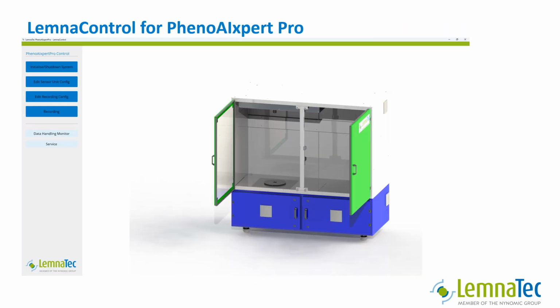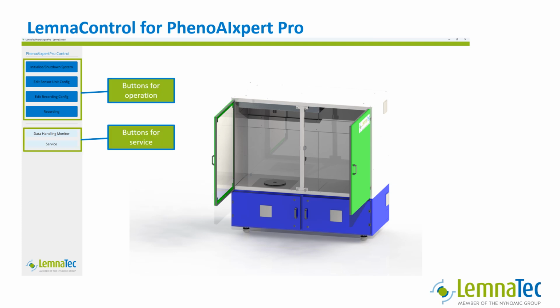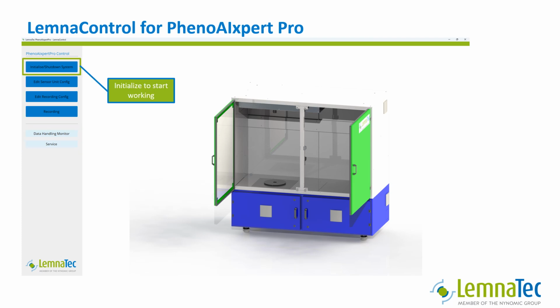Let's start with LemnaControl for the PhenoAIxpert Pro. This is the start page. The start page has buttons for operating the PhenoAIxpert Pro and buttons for service. To start working, we first need to initialize the system. Therefore, we click onto the Initialize Shutdown System button.